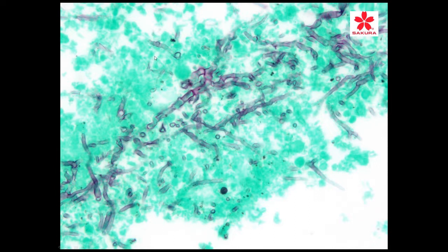Because of the anastomosing nature, these grow in all different directions. So you see this growing in a certain direction, and then all of a sudden you see this here that looks like an oval shape. Well, that is actually the organism now growing towards you. And so as we take this section in microtomy, we're looking at a cross-section of it. So even though some of these look like buds, they're still actually the anastomosing elongated fibers. Another thing to note in this is the light, delicate nature of the background stain, the counterstain, which is a light green.